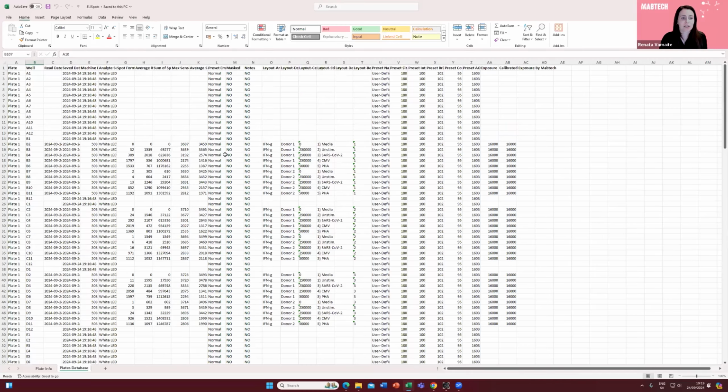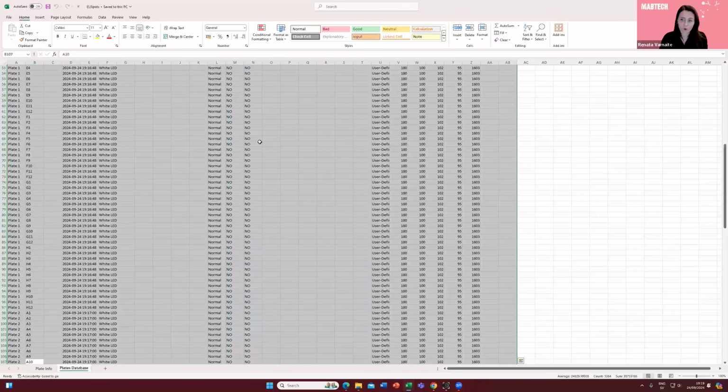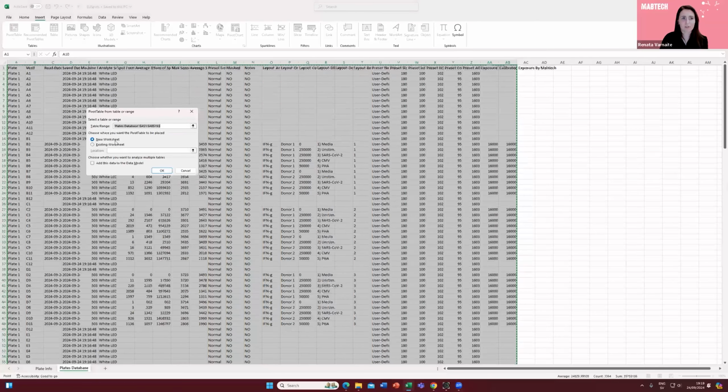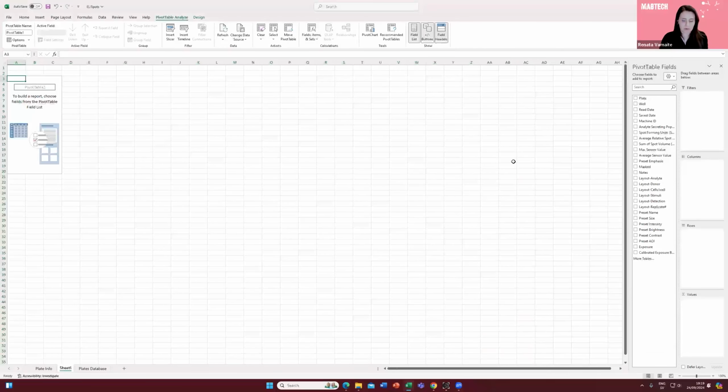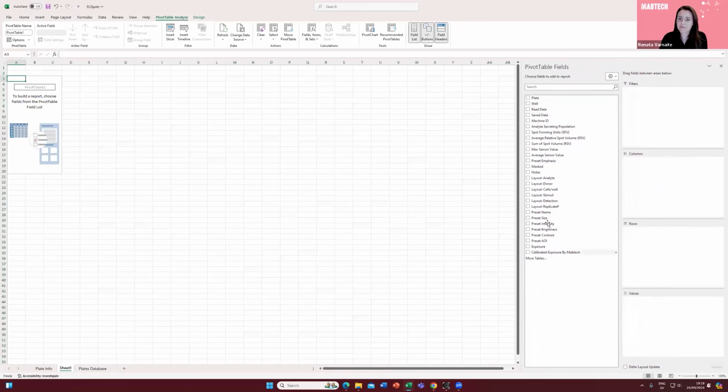The way that you can go into the pivot table analysis is to highlight the full table here. All you need to do is press Control A, which automatically highlights the full table, all of the information in this tab. Then we go into Insert and insert pivot table. We're going to choose new worksheet so that we create a new tab. And here we are. So, pivot table: all the information that was in that massive data table is here. These are the columns of that table.